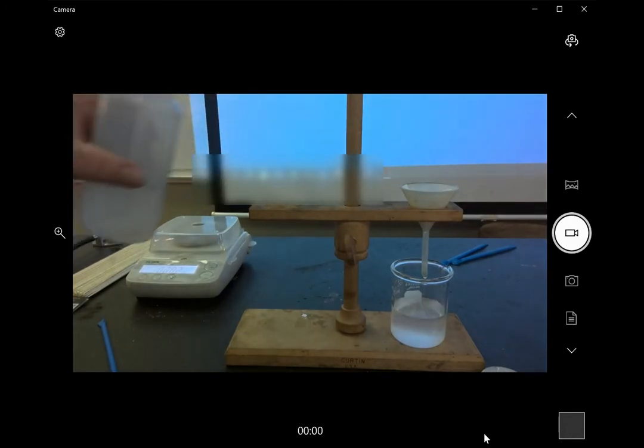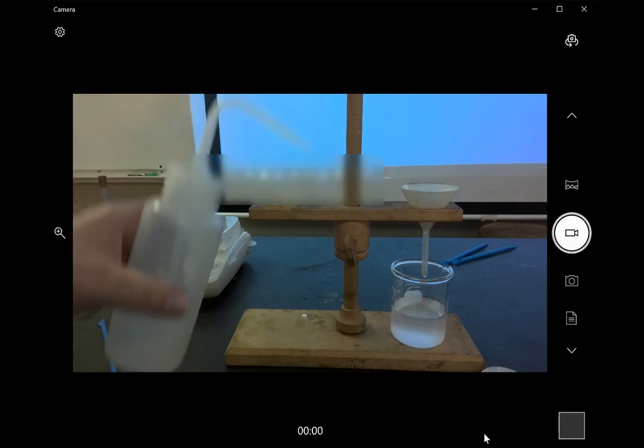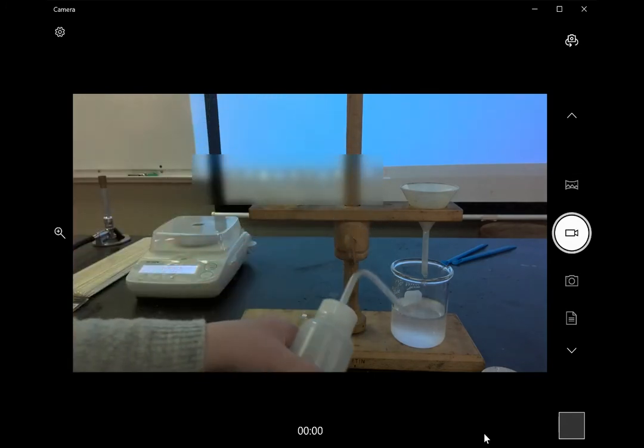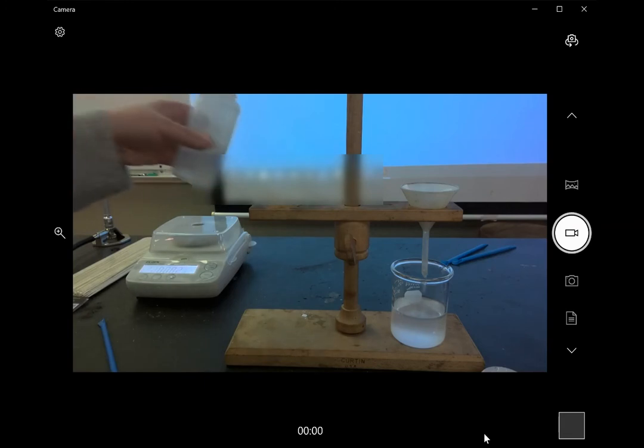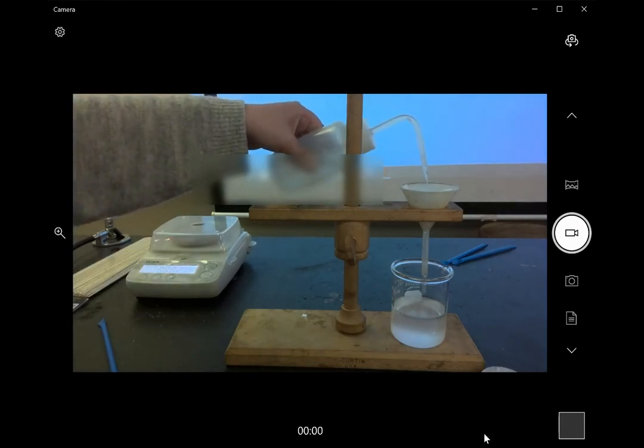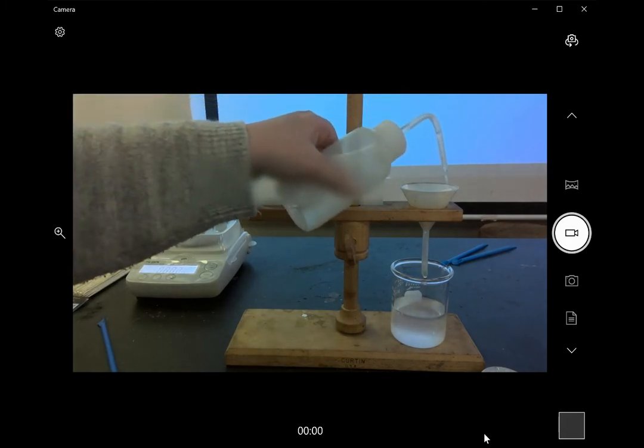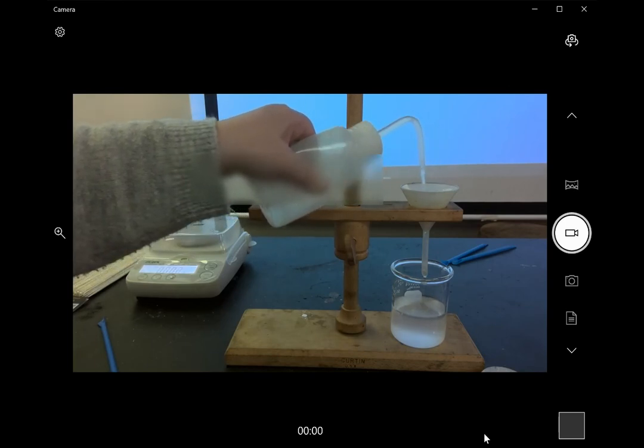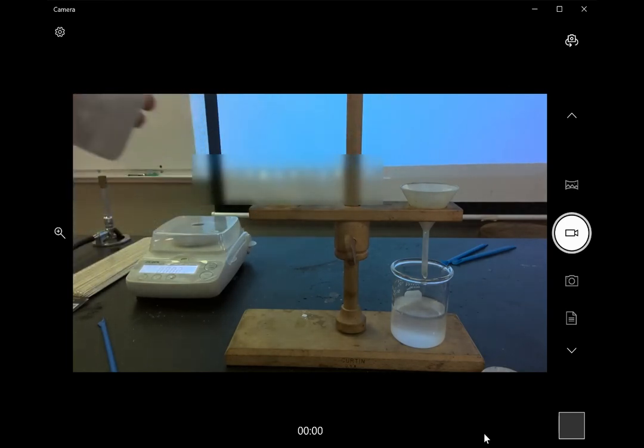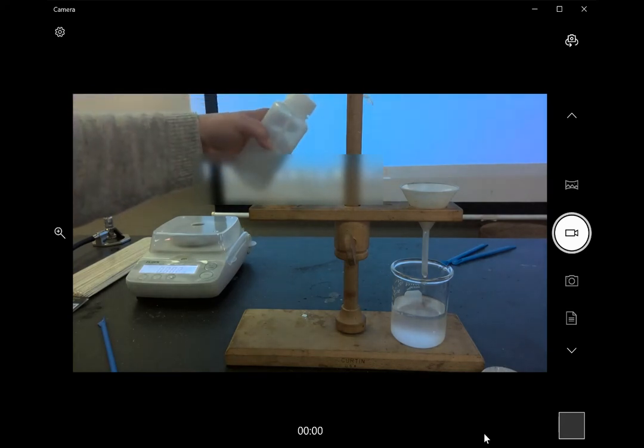We want to keep in mind that the solution that's running through the filter paper, that's coming out into the beaker, is not just water. It also contains any spectator ions. So we want to make sure that we rinse the captured precipitate so that we get all of those spectator ions off, and that the only thing that remains in the funnel is the precipitate itself. It's probably still going to be a little bit wet, but we want it to be wet with just water, no extra ions.